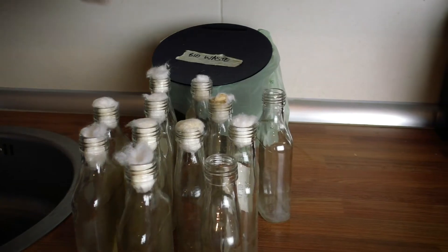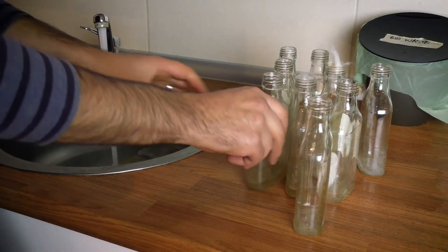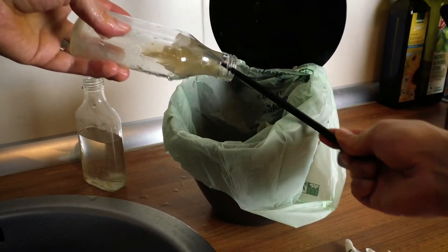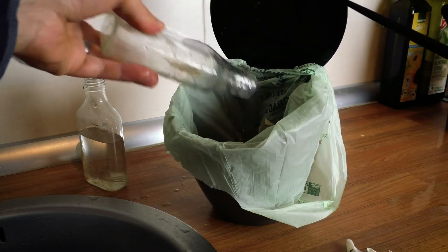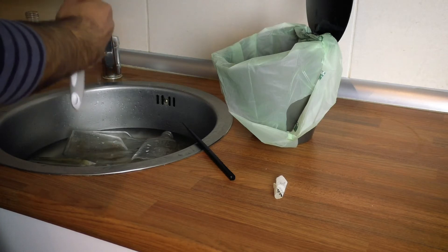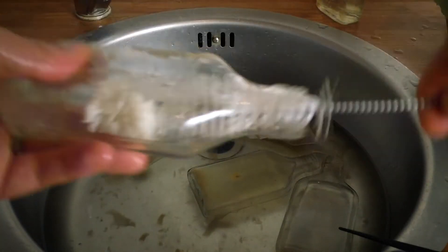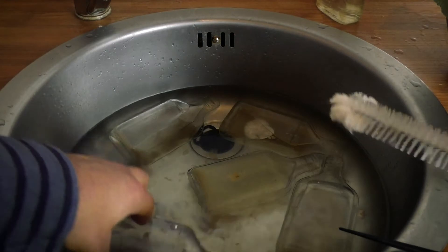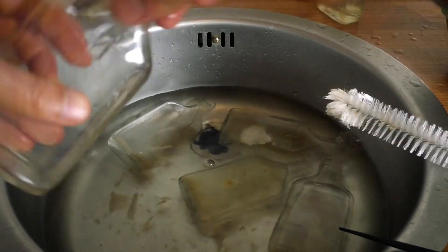Cleaning the bottles is basically a process of getting out the old agar. Soak them in water and then I use a chopstick to jam in there and move about, and often the whole agar piece just comes out in one piece. It can go straight into the organic recycling, and then any bits that are tougher and stuck on the bottle I get out using a bottle cleaner pipe cleaner thing. Bear in mind that the bottles don't have to be perfectly clean because you're going to sterilize them anyway — you want to get the pieces of agar and mycelium out but you don't have to get them perfect.